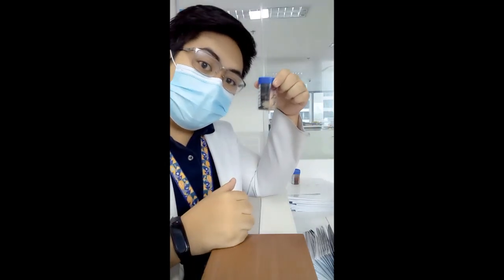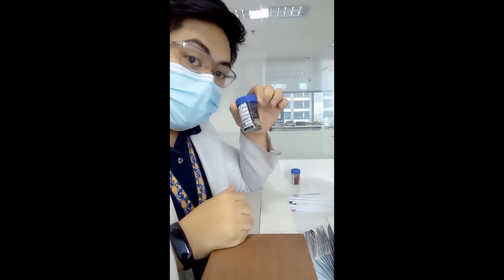Once the technologist is finished examining the tissue, he logs it into the log sheet. When the tissue samples are ready and logged, they are sent to the laboratory at the back. Okay, so let's go there.